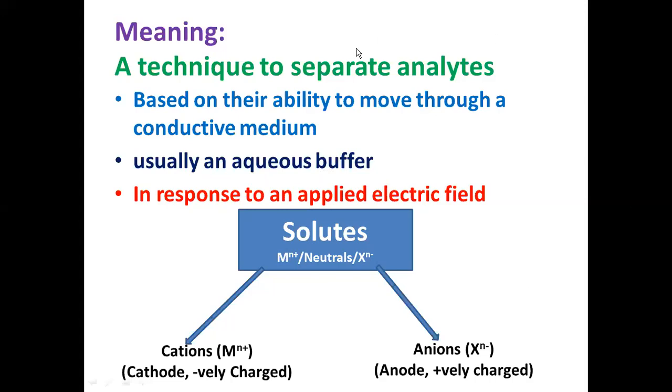That is also some special type of migration that we shall see later. So you take a medium which is immobilized with the aqueous buffer, and this aqueous buffer is immersed with two electrodes. One is a positively charged electrode and the other is a negatively charged electrode. They are connected to the power supply device. The electrode at the positive terminal is the anode and the electrode at the negative terminal is the cathode. When you apply an electric field of any magnitude, it is denoted by E.